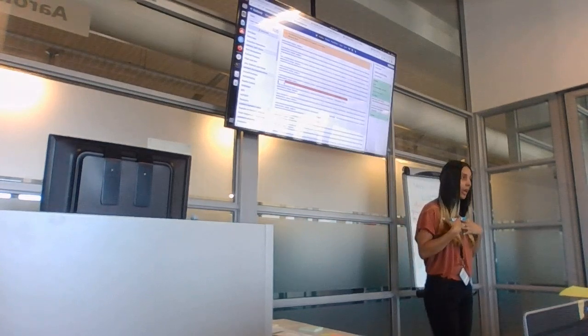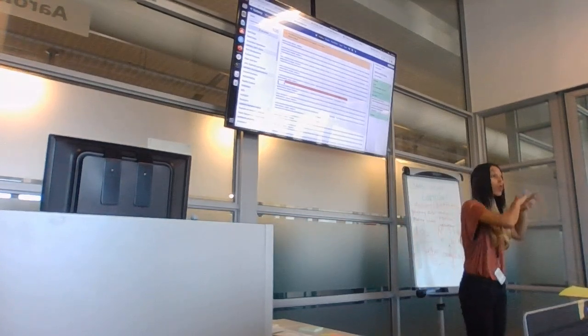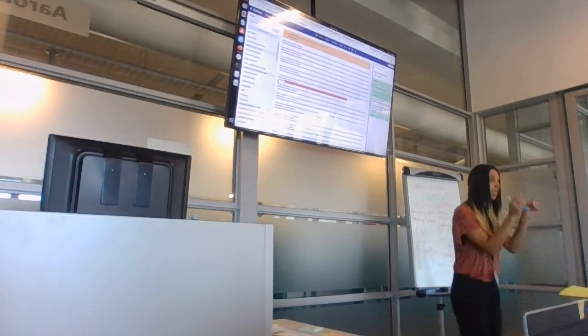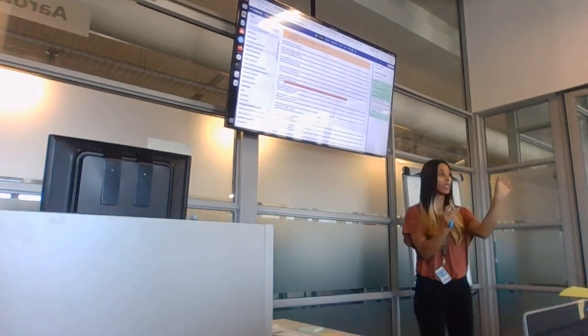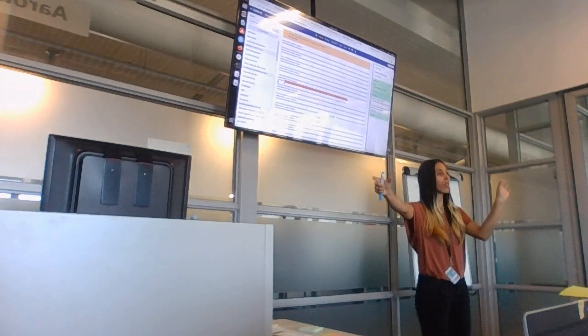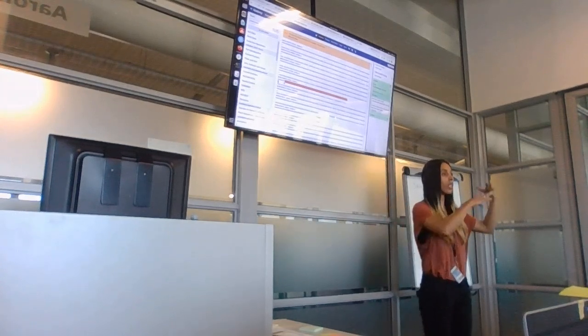I'm more likely to have more in common with the human one because it's all the reads. I'm not taking one small fraction of this forward file's reads and then a random section that may be longer. I'm taking all my reads.